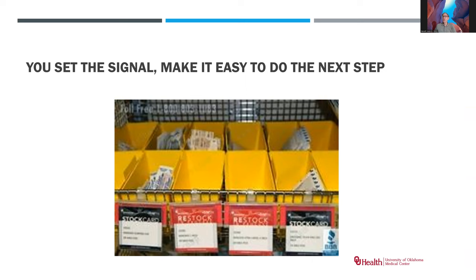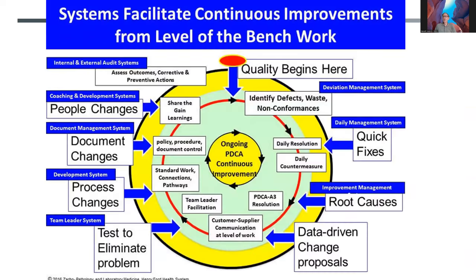Well, this can be taken to a dramatic situation to look at all of your processes to try to eliminate waste. This is an example from some of the work done at the Henry Ford Health System in Detroit, which is very process oriented, to look at all of these sorts of things in your processes that can be improved. And looking at those for opportunities regularly.